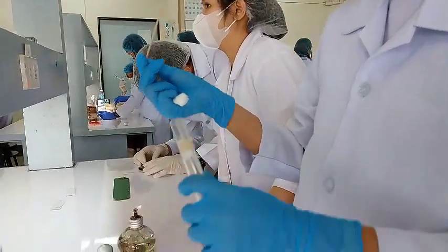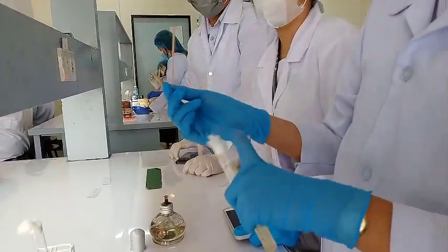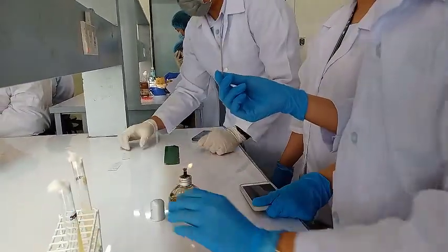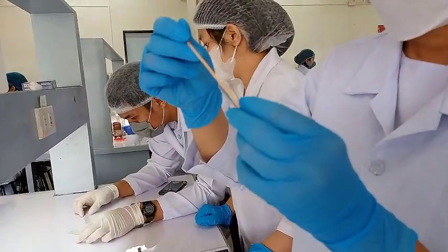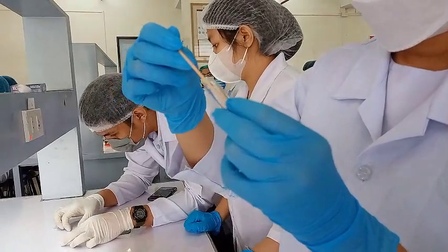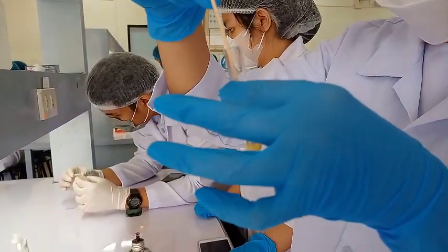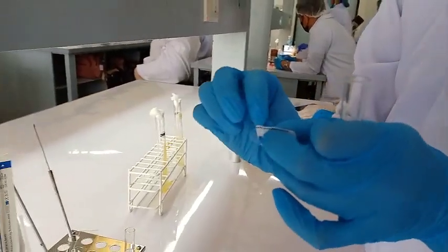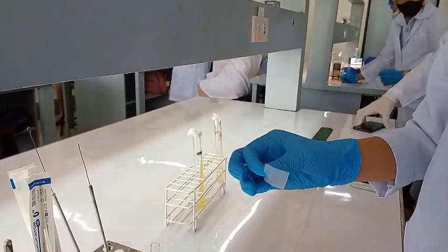In this step, we are going to inoculate a loopful of Staphylococcus into 0.5 ml of 1:4 rabbit's plasma. Then mix the colony into the rabbit's plasma. Then put parafilm on the tube to secure the solution.